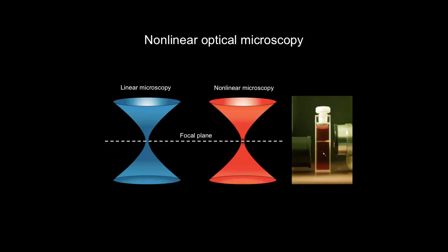It shows how the fluorescence is excited in a large cone of light when you excite the fluorophore. This is a dye in a cuvette. When you excite the fluorophore with the short wavelength, the fluorescence is excited along a large cone. I'm going to take this off so you can see the dot, the point where the arrow shows. So this is how the excitation occurs when you excite with a long excitation wavelength, and you get this nonlinear fluorescence. Is that clear?